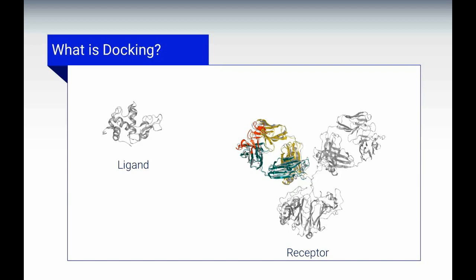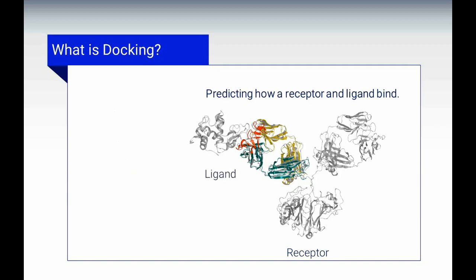Each individual binding group, either the receptor or the ligand, can consist of multiple chains, much like an antibody. What we're interested in with docking is predicting how the receptor and the ligand are going to bind with one another. And what NovaDock will do is spatially arrange a ligand against a receptor structure, both through three-dimensional space with translations and rotations, but also with a flexible modeling approach that deforms the protein backbone along a mathematical model called normal modes of motion.